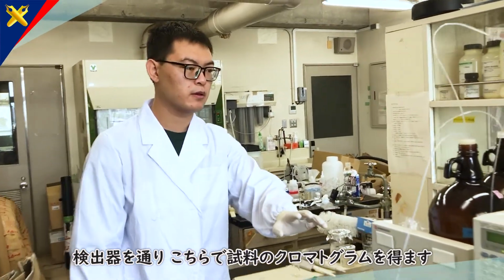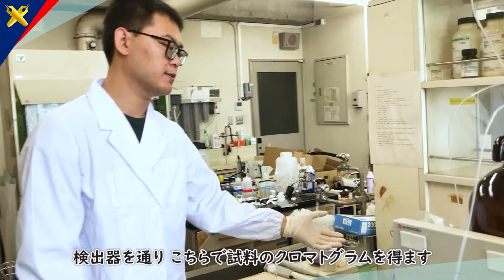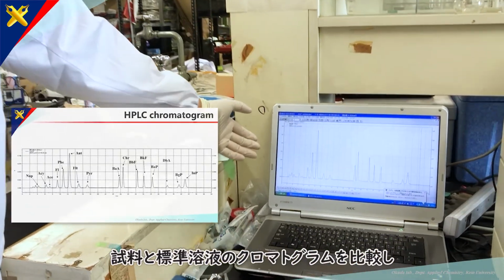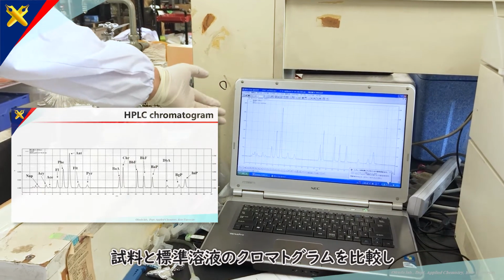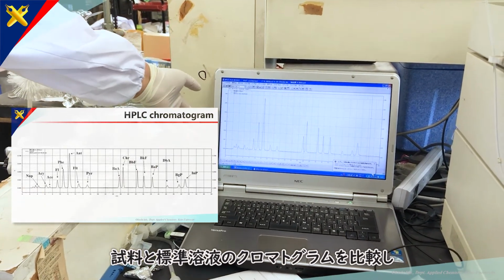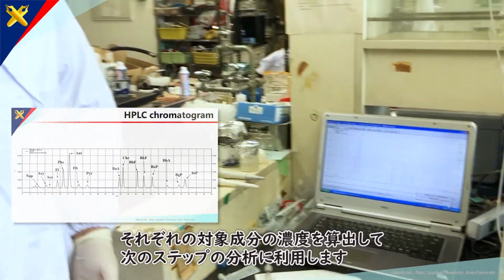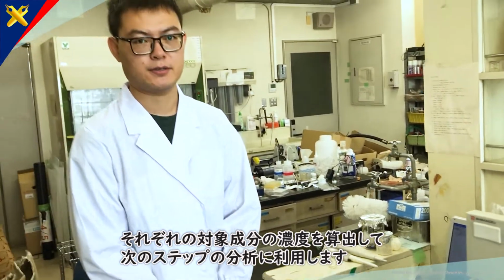So we use the UV detector to analyze the pollutant characteristics. Then through the UV detector, we will get the sample chromatogram here. We compare the sample chromatogram with the standard solution chromatogram, and we will calculate the concentration of each pollutant for the next step of analysis.